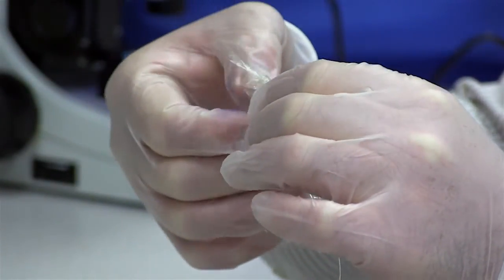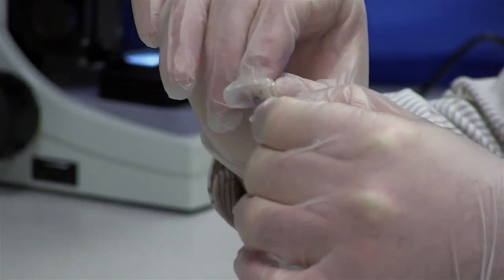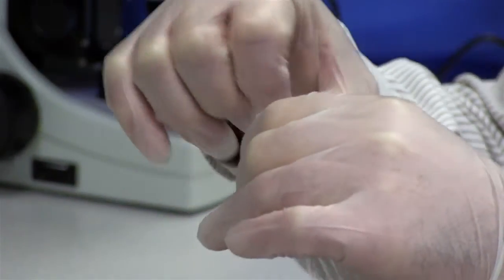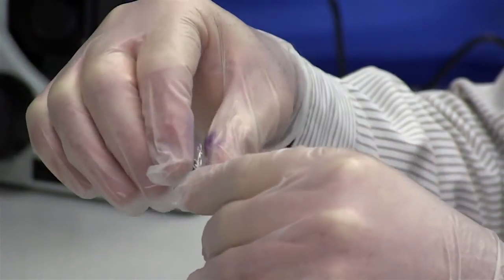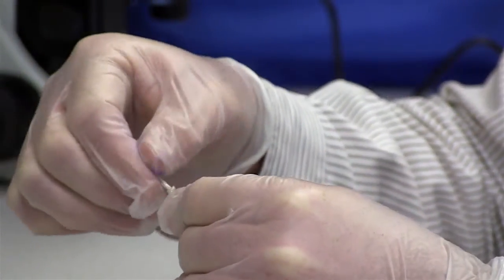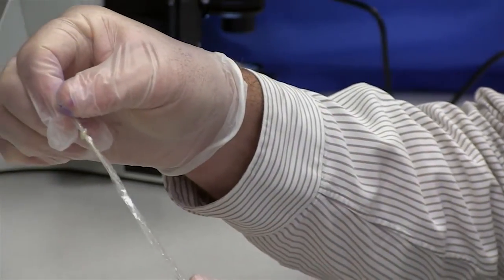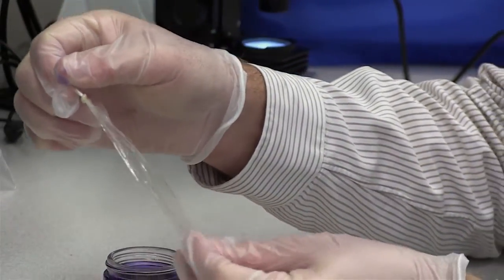So I'm just going to work it down until I can get it close to the end. And then I want to pull it tight so that it's watertight. So now we have an overhand knot in one end of our dialysis tubing.